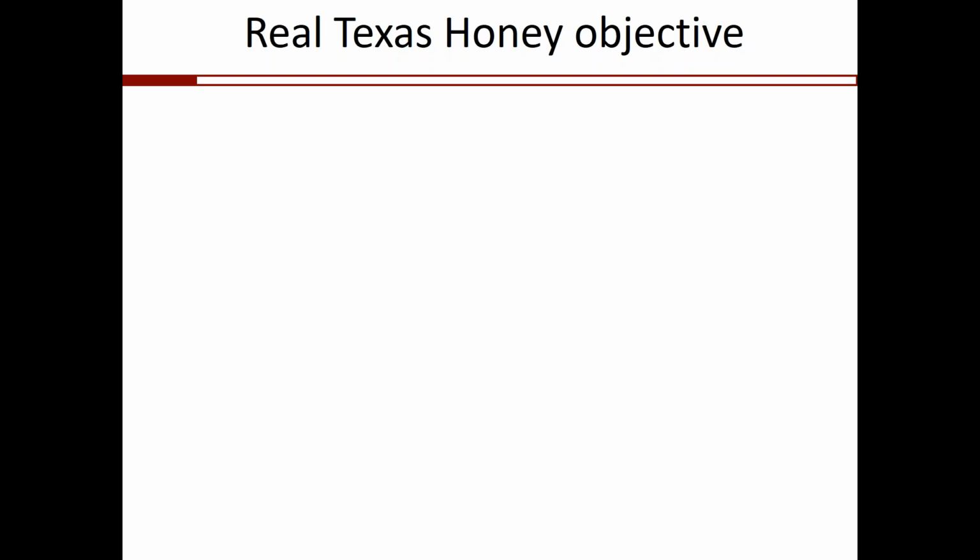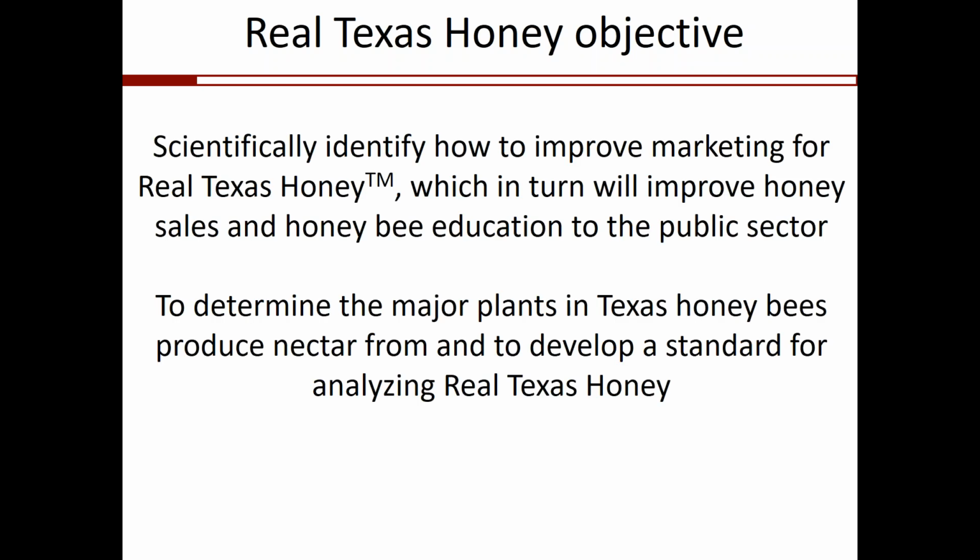Another one, of course, is to test honey using microscopic determination of pollen coefficients to determine the regional denomination of origin or an approximation of that for real Texas honeys. And that's the project that we are finishing up here at Texas A&M University. So we're determining the major plants in Texas that honeybees produce nectar from, and to develop a standard for analyzing real Texas honey.